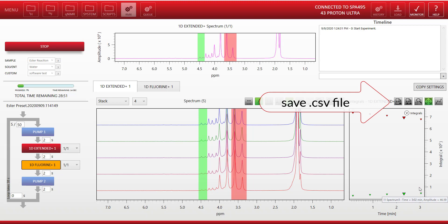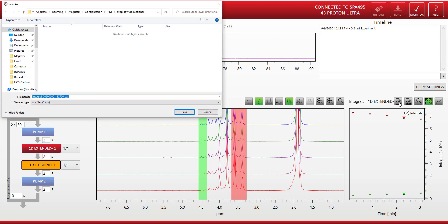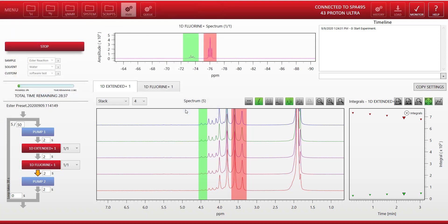At any point we have the option to click this button here to save a CSV file of the different integral values over time. And that file could be opened in Excel if you wanted to analyze the data with a different program as you're running.